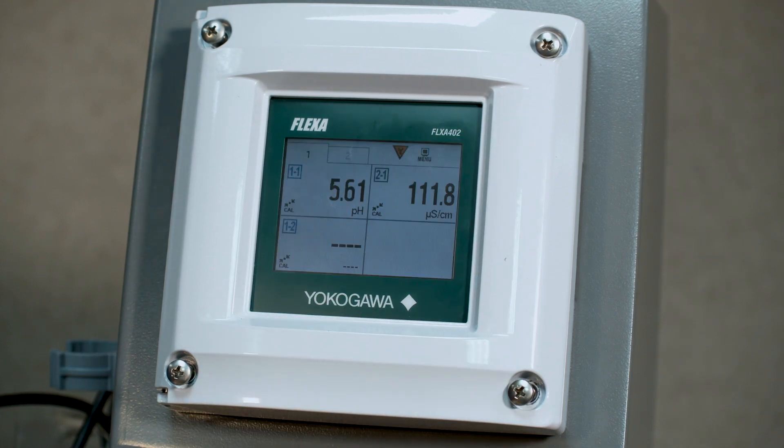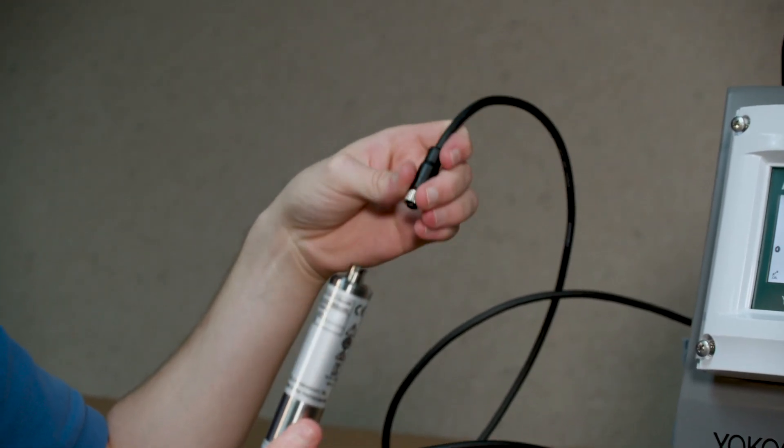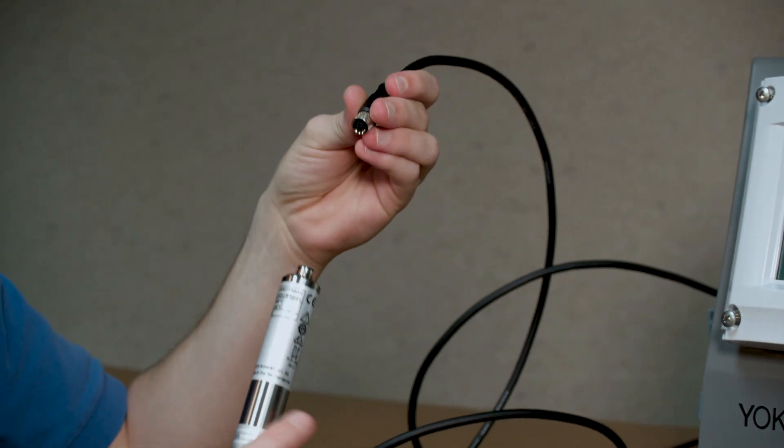And now we're going to plug in the sensor. Here we have the FU20 attached to our SA11, which we're now plugging in to the BA11 sensor box.